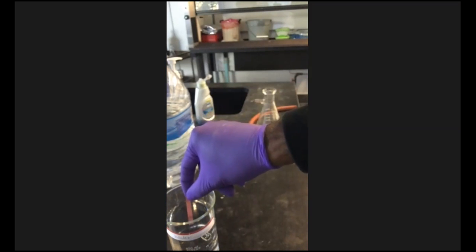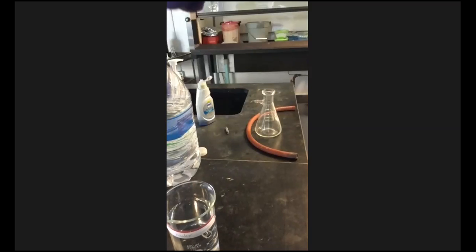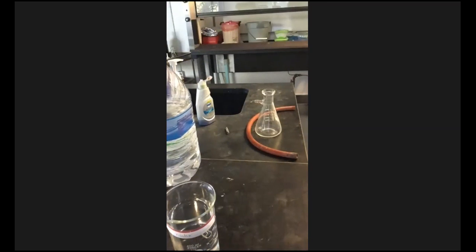All right, so we're going to just test the pH of the water. It should be neutral, not tap water. You can see that it didn't change at all. I dipped it into the water and the water is fine. Spring water may be a little alkaline, but purified water, you expect that to be neutral, and it is. So we've done the pH check on our water, and now we don't have to do any adjustments. We don't have to add any ammonia.